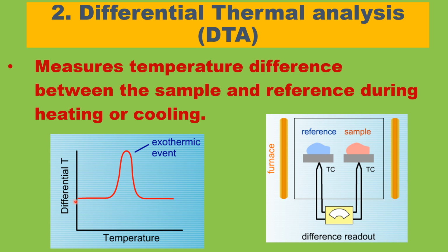As you see, the temperature difference ΔT between sample and reference increases because of the exothermic reaction. Here there is no reaction, so there is no change in temperature.